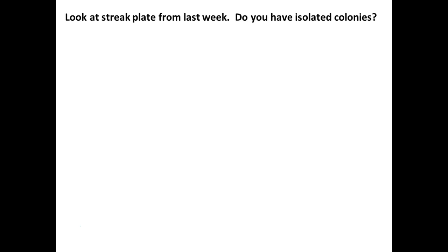One of the organisms that I gave you, I think I told you a little bit about last time, is this reddish one. It produces this pigment at cooler temperatures. So when we grow it at 25 degrees Celsius, it produces that pigment. When you grow it at a higher temperature like 37, equivalent to body temperature, it actually does not produce that pigmentation. That heat must shut down that mechanism, and so they're actually white. Or you could almost say colorless.